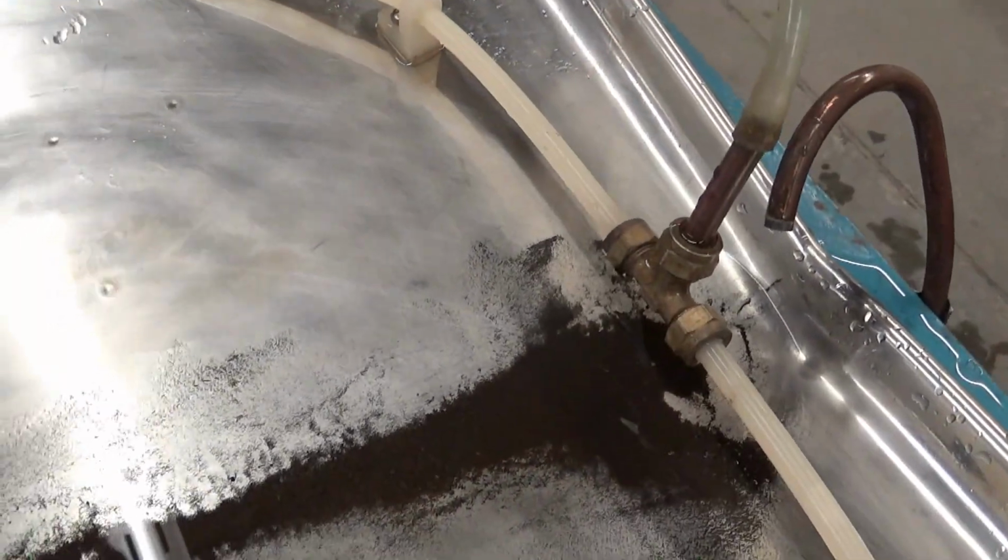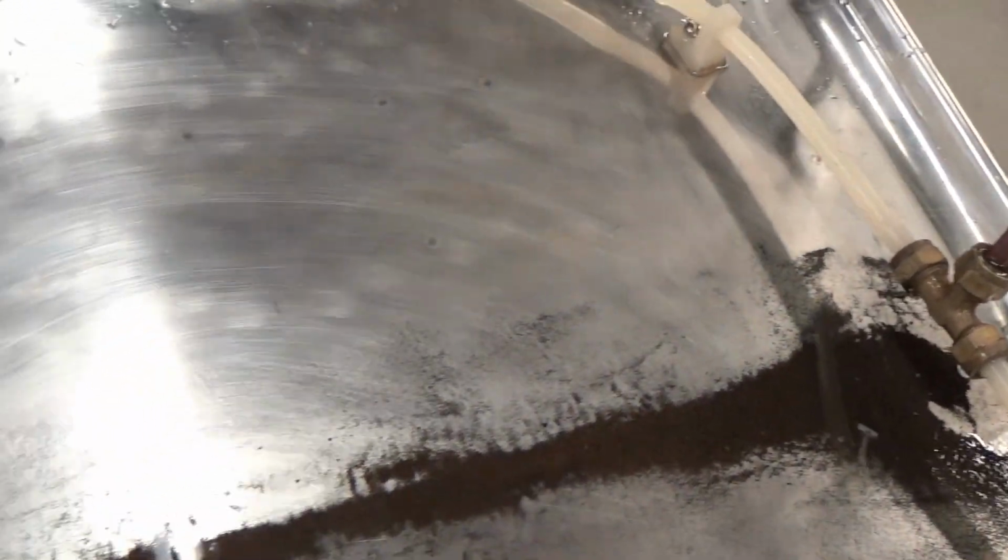So there we've got the, I'm guessing that's mostly magnetite there. Okay. Because I mean it's so dark. Dark, yeah. You know, there's no red to it at all. You probably got all three in this one. Yeah. So I think that's a good place to stop there. Okay.